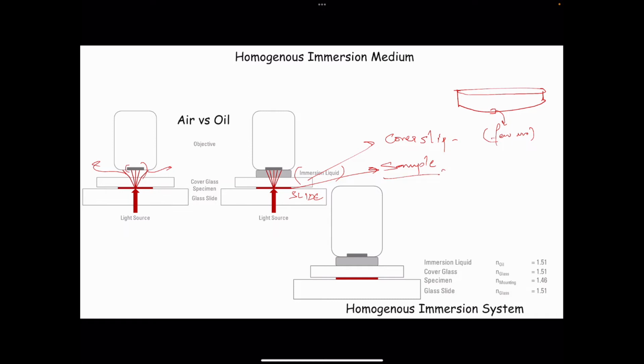However, this is the best way we have, because you need to maintain the physiological temperature that the cells will require. A physiological pH is of utmost importance for cellular integrity. Apart from this, there are several other factors required, such as nutrients, etc.